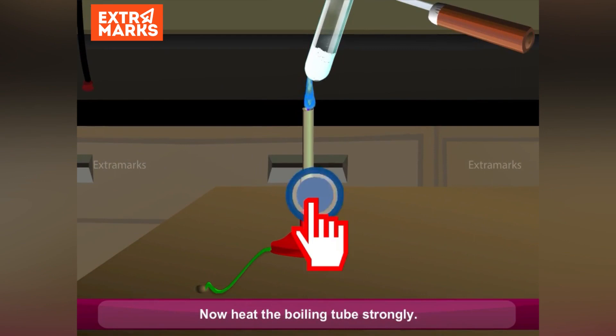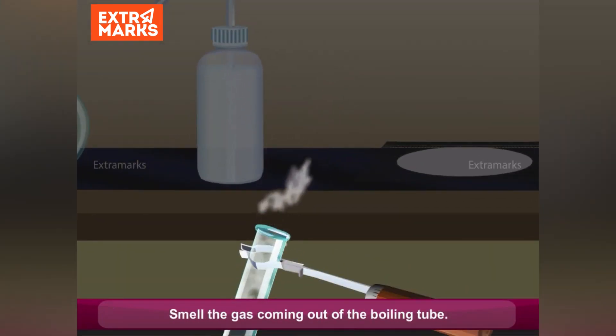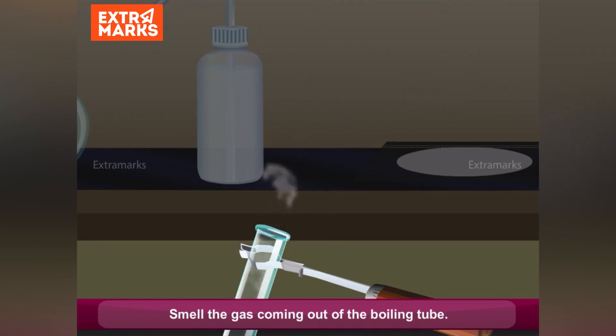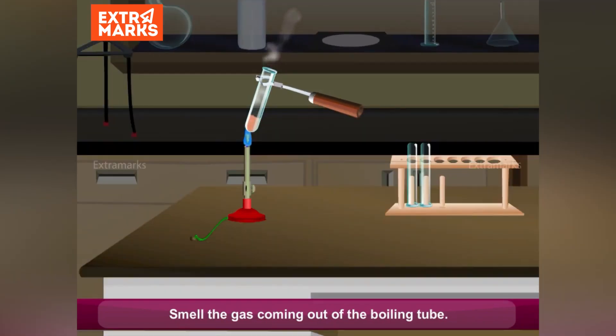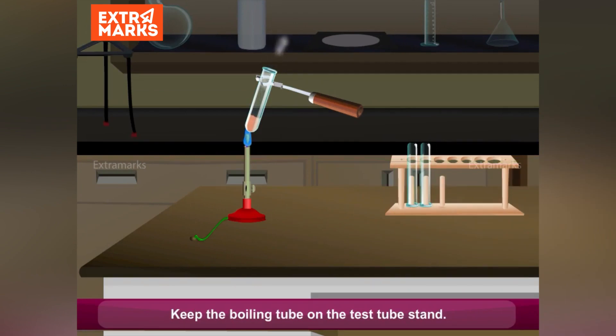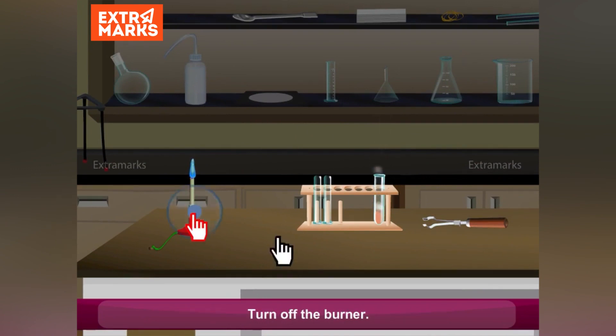Now heat the boiling tube strongly. Smell the gas coming out of the boiling tube. Keep the boiling tube on the test tube stand. Turn off the burner.